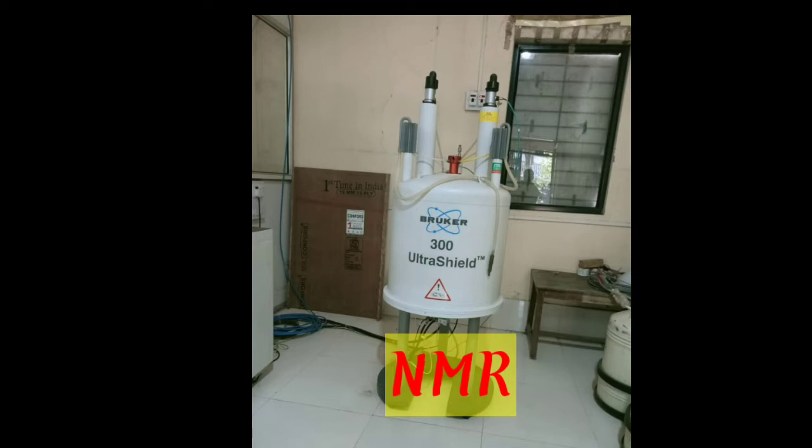It is used to determine the structure of organic molecules in solution and to study molecular physics and crystalline as well as non-crystalline materials. In NMR, it is used for the analysis of molecular structure and the identification of an unknown chemical substance.